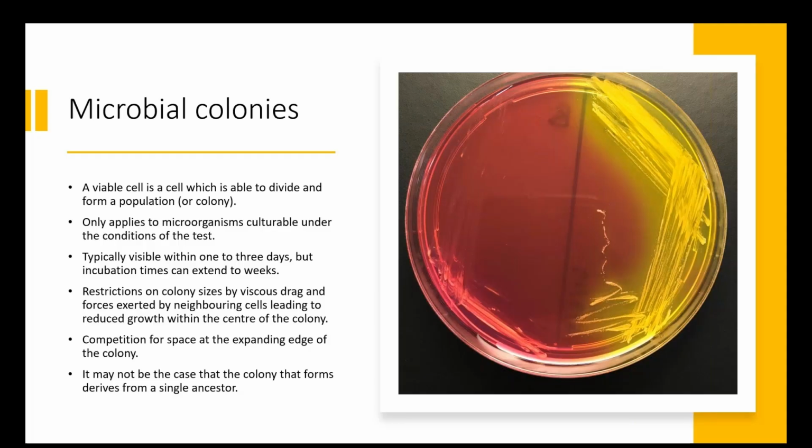The growth of a single bacterium in a defined location in the agar plate can give rise to this colony that eventually becomes visible over a period of time. Depending upon the organism, the incubation conditions, the atmospheric conditions, and the formulation of the agar, that might take 1 to 3 days, or it could extend to a much longer period of time.